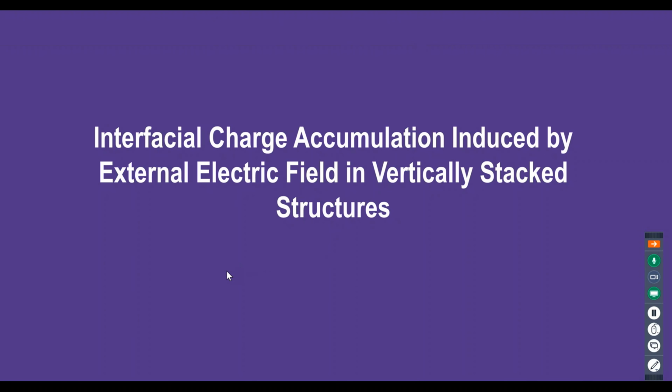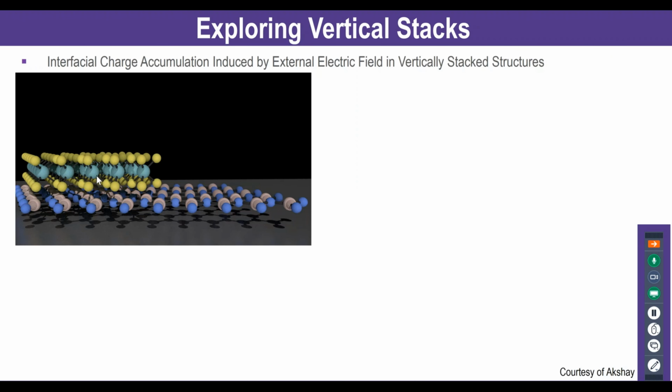So, keeping in the same realm here, one thing that we started to do here is looking at the interfacial charge accumulation, also in the same type of geometry, but now adding a layer at the bottom of the molybdenum disulfide. I'm just going to give you a quick example of what is possible to do. This is a rendered image of the stack that we have. We have hBN, hexagonal boron nitride, at the bottom, and the molybdenum disulfide on top.